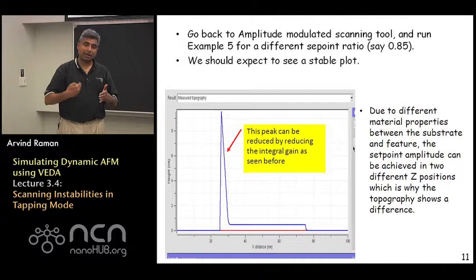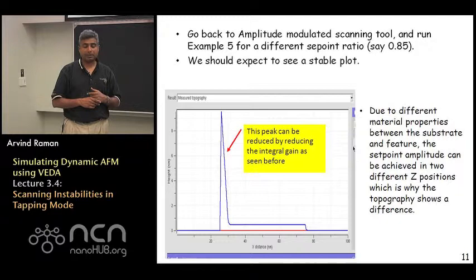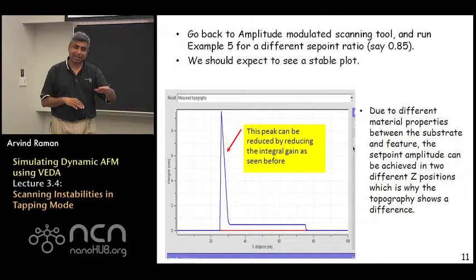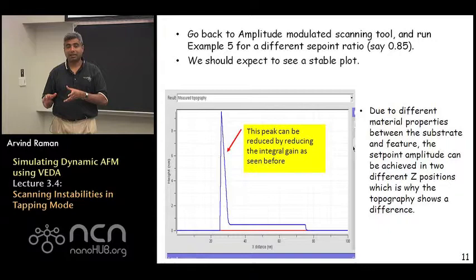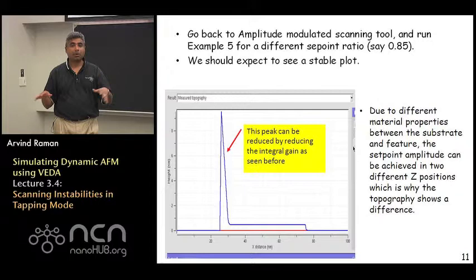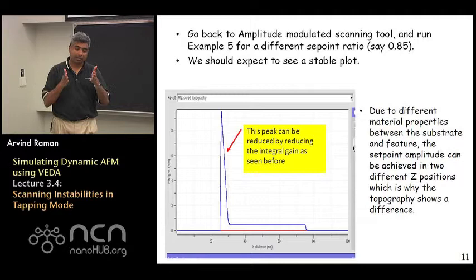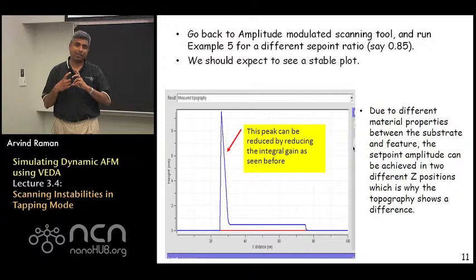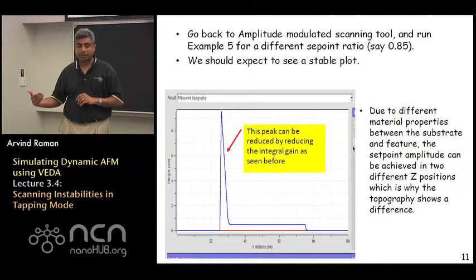The other thing I want to highlight here is the fact that the measured topography which is what is shown on this graph is not flat all the way through even though in the simulation we had created an absolutely flat surface. The actual topography being measured here is not flat. It is flat while you are on the substrate, but when you reach this feature, the feature is going to appear to be a little higher than the substrate. Why is that so? Especially because the elastic modulus of both the feature and the substrate are identical. Why is it that the feature is going to appear to be a little higher?